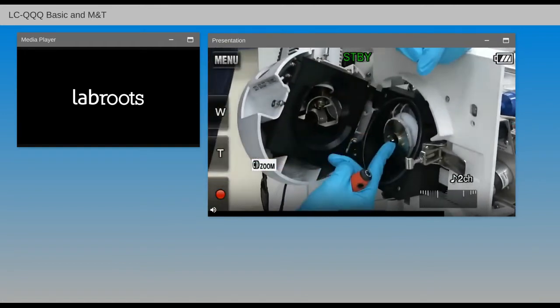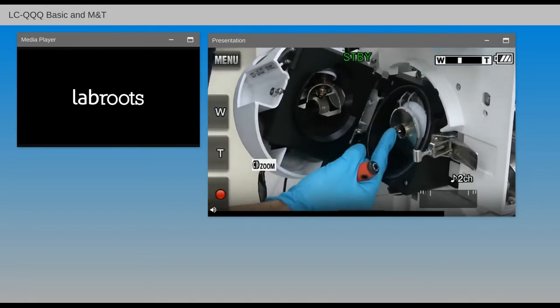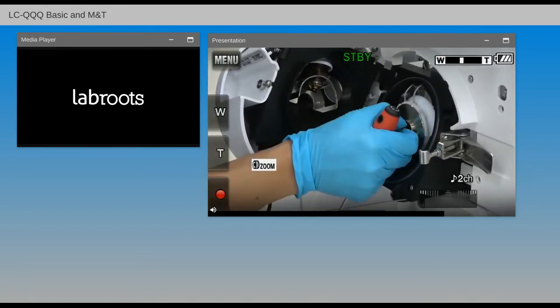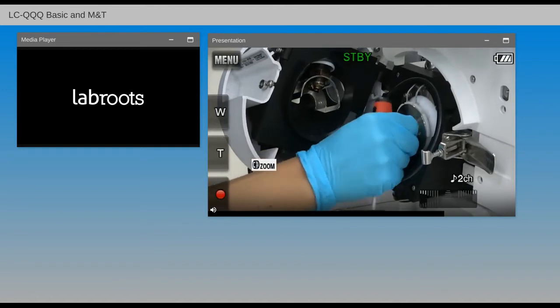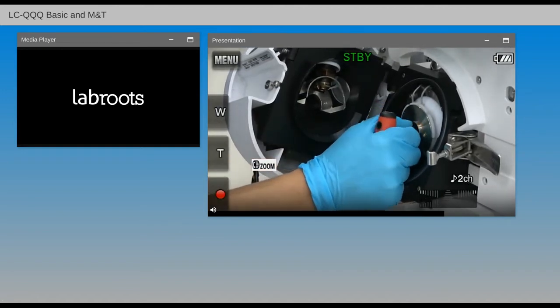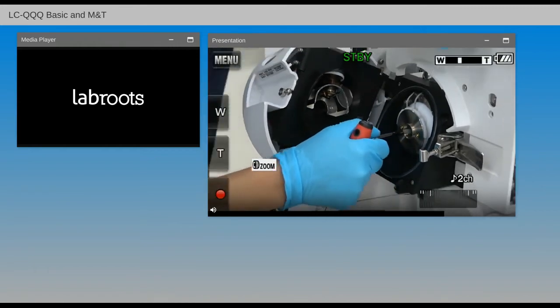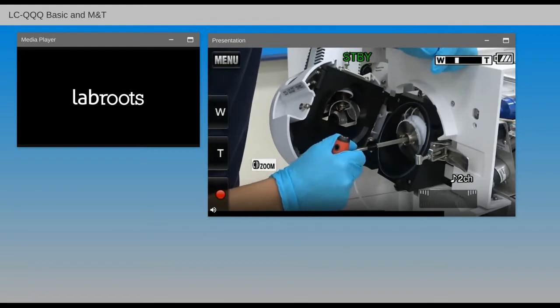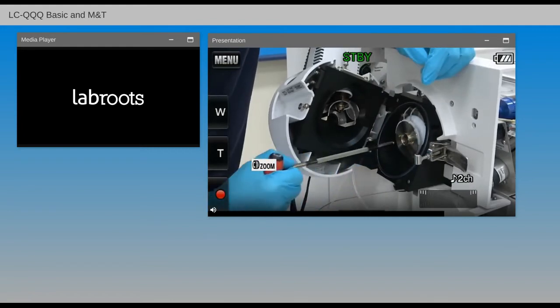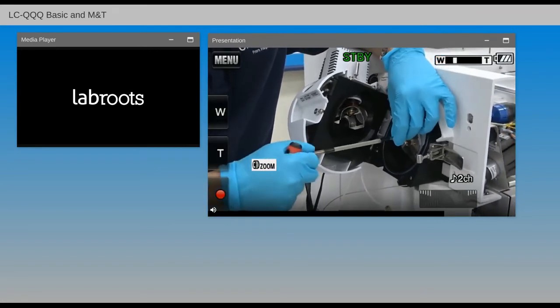And you can see the capillary, the resistive capillary, being this part, so we can actually try to remove it. All of this is supposed to be done in a vented state, right? However, with the new technology from Agilent, instruments can be serviced without a full vent, which will be part of the later part of this webinar.